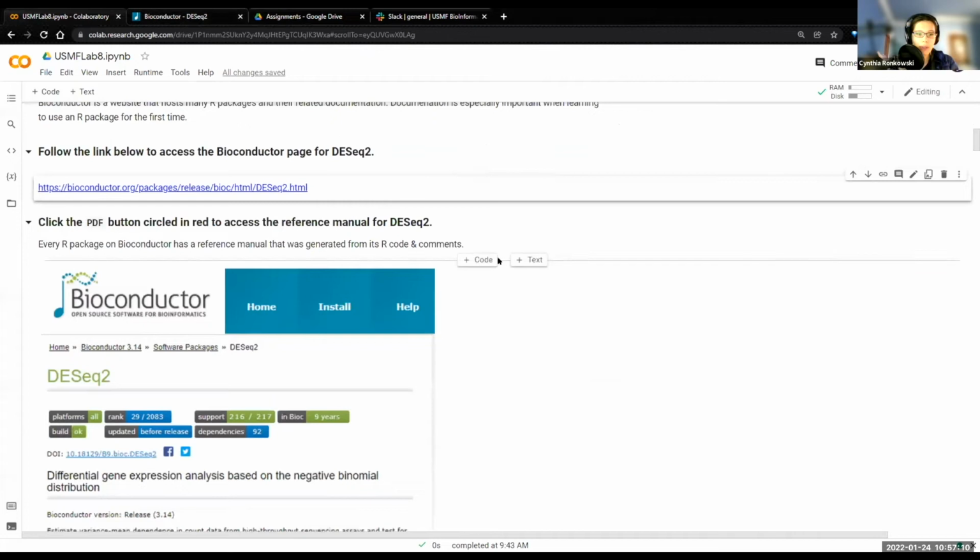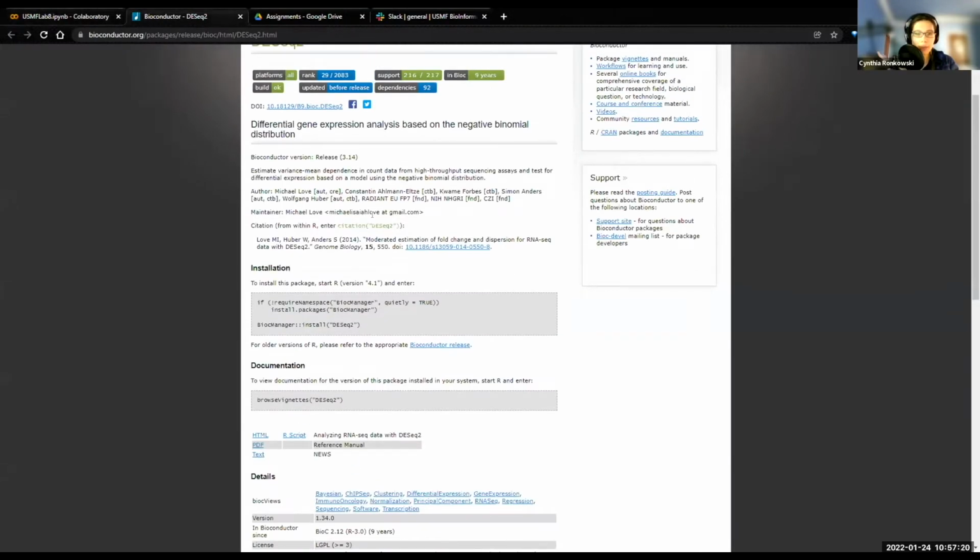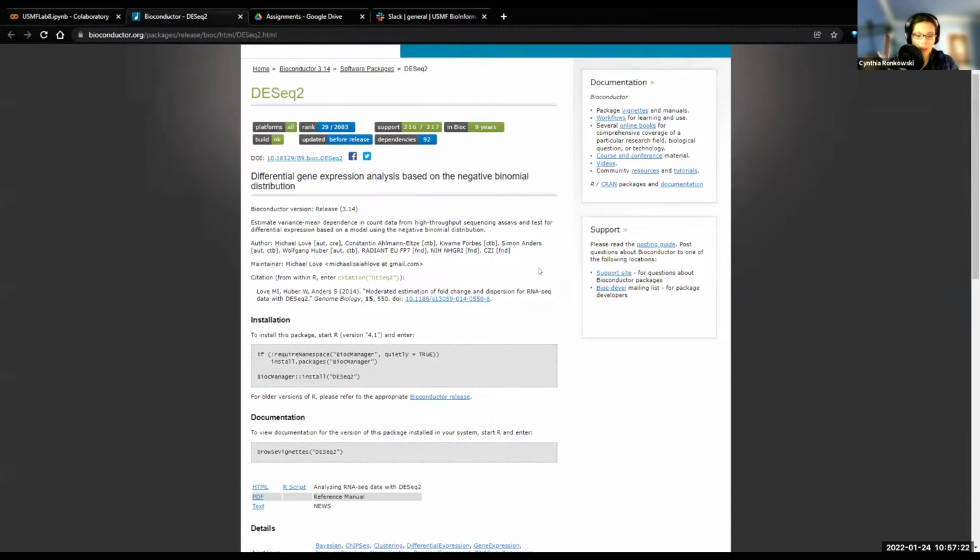So in order to, oh wait, actually, since Sergey didn't introduce DESeq2 yet in the lecture, as a short way of describing it, within the lecture, he introduced using FASTQ files, and either through alignment to some reference or through quasi-mapping, that you're able to get count data.